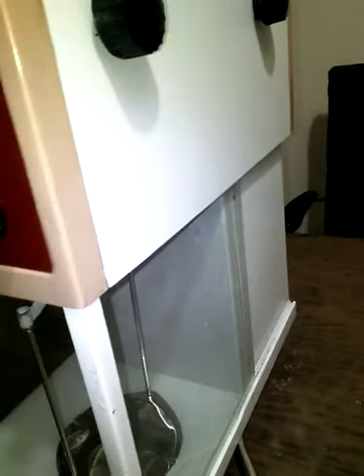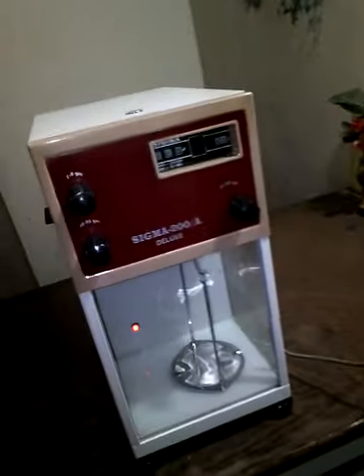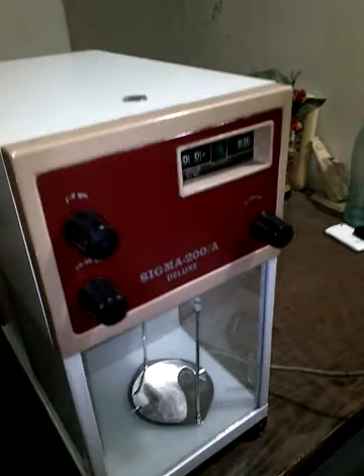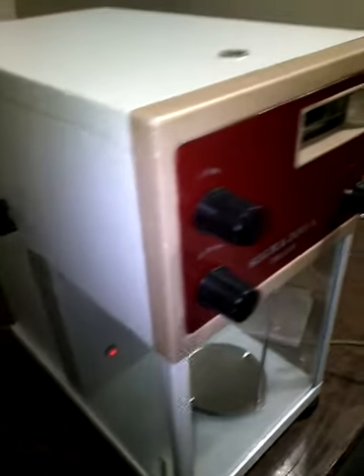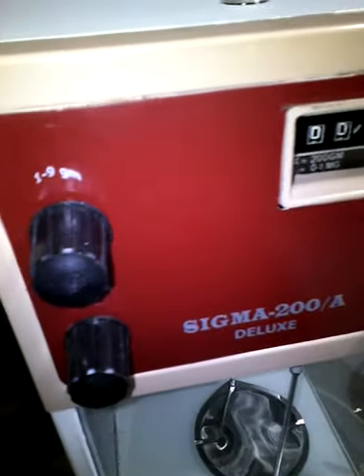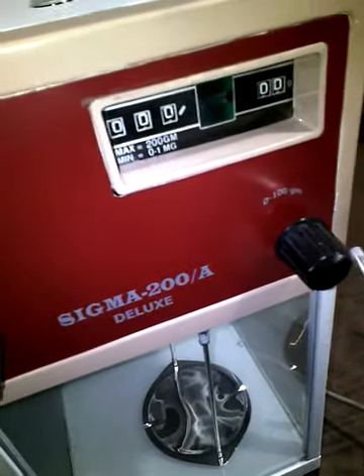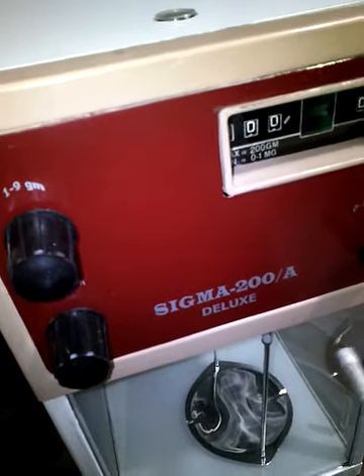Before proceeding towards the installation of the balance, we need to get familiar with its component parts. Going through the overview of the balance, you can find there are some parts. Let's go through the front side first. At the front side, you can see there are three different kinds of knobs. These are called dial knobs, which are used for lifting different weights.